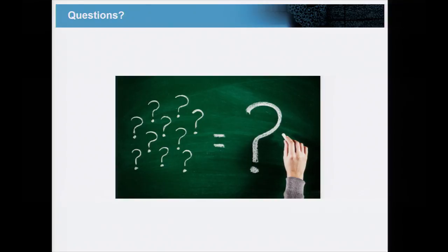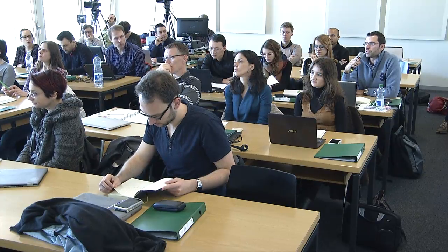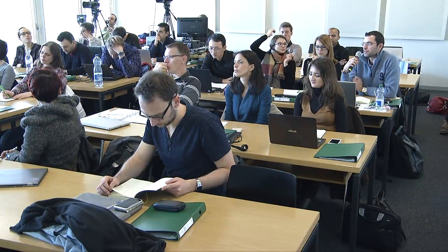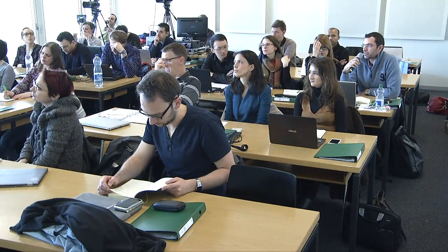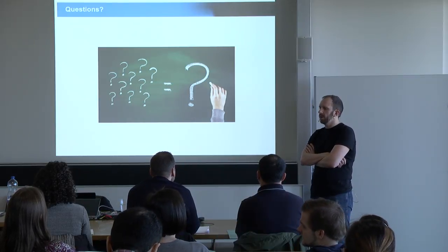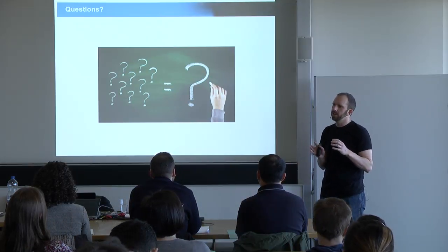Question: How much time does it take to go through the whole process that you just described? And how much is subject to the person, the operator, versus automatic? Okay, so they asked, this is a bit dependent on how big your DDA data is. In the protocol paper we wrote, we put a toy example, which was 3 DDA files.